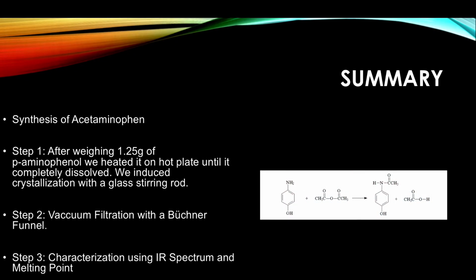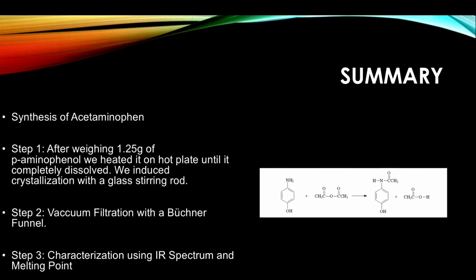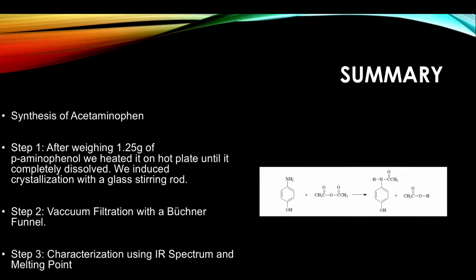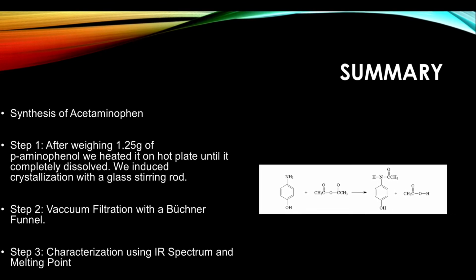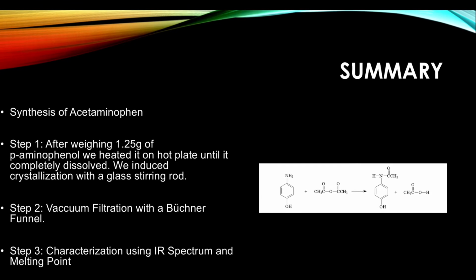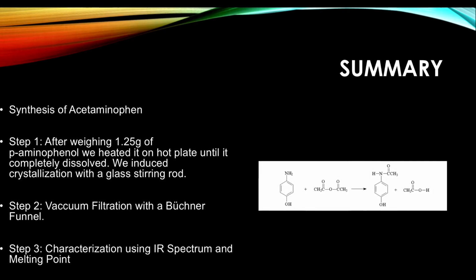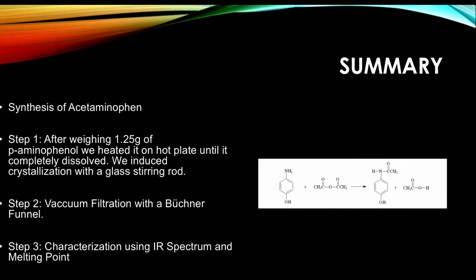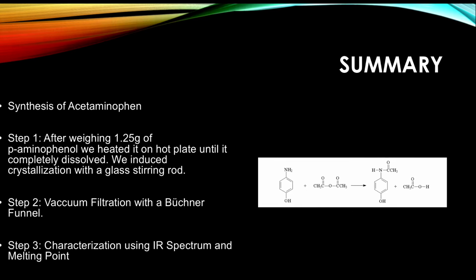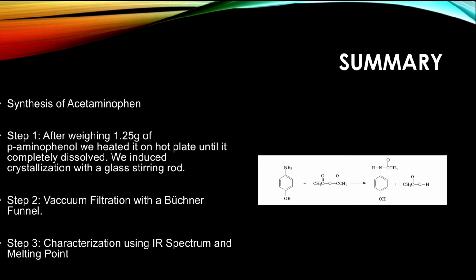In this experiment, we had 3 steps. The first step was synthesizing the acetaminophen. First, we took 1.25 grams of p-aminophenol, weighed it, and heated it up on a hot plate until it was completely dissolved. We induced crystallization with a glass rod.